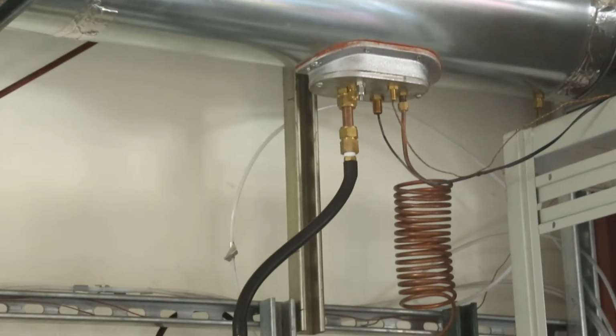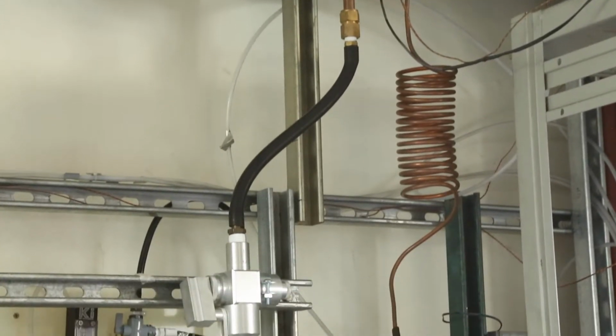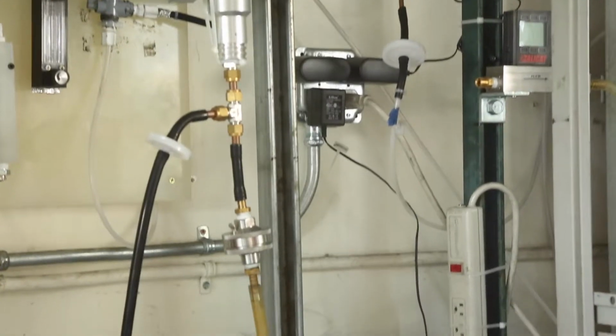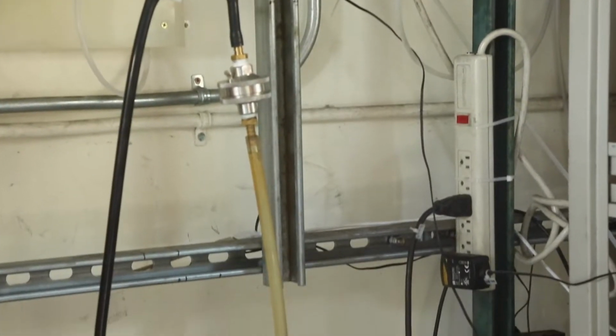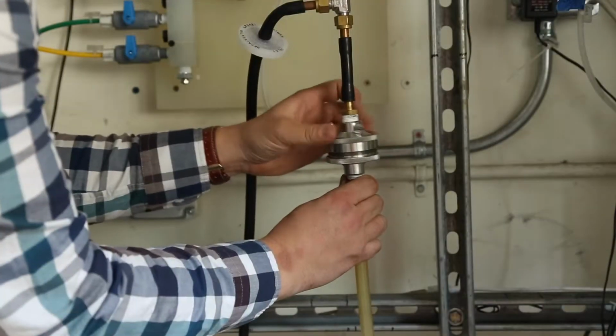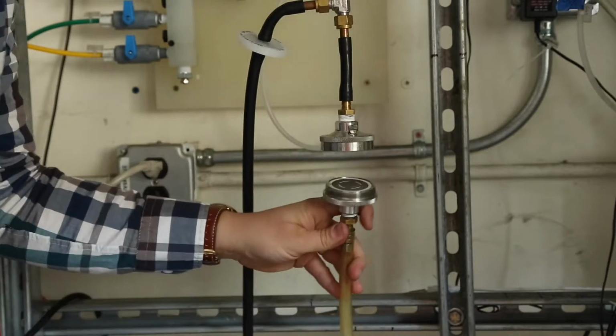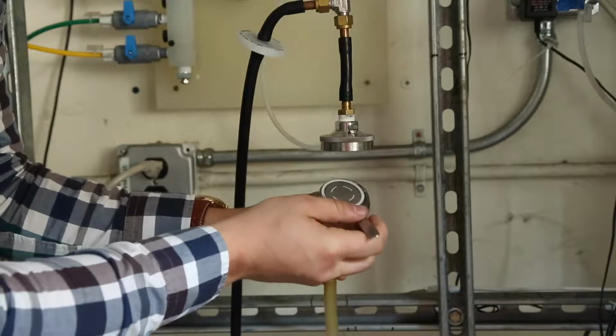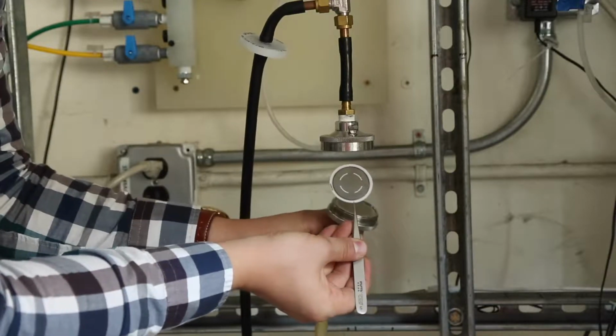The purpose of a gravimetric sampling system is to deposit aerosols of a known particle size range and from a known volume of air onto a filter. By comparing the difference in mass between a clean filter and a filter loaded with aerosol, we can calculate the average aerosol concentration in the air that passed through the filter.